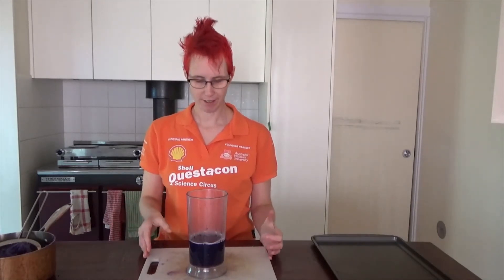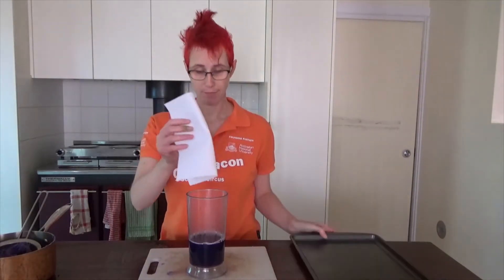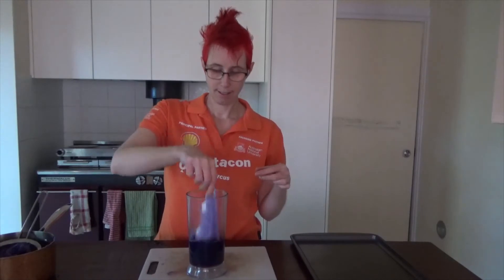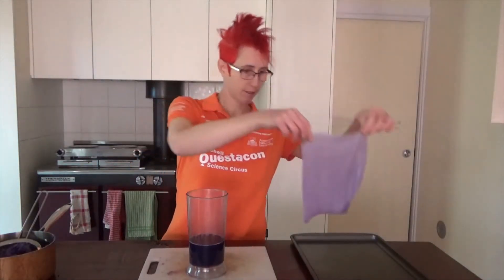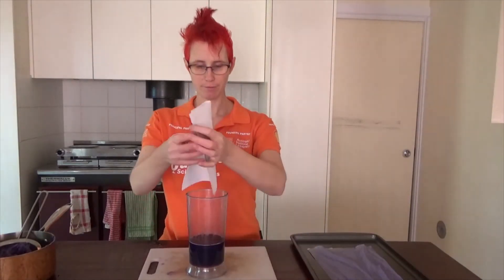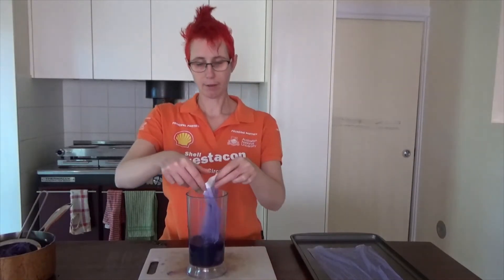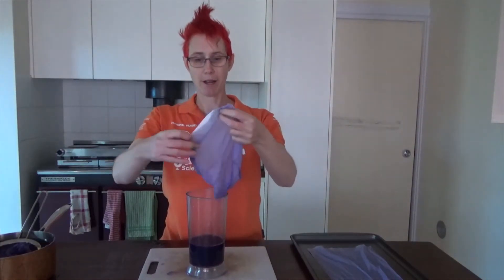Look at that purple color — isn't that great! The reason I have the board is to stop any spills, because we are trying to get the anthocyanin out of the cabbage and use it to stain the paper, and that means the anthocyanin will also stain other things. So we've got our paper — I'm just using some paper towel — and a tray to dry in because we don't want to just leave it on the bench. If you don't want your fingers stained, dip the paper into the cabbage juice but leave some dry so that you don't get it on your fingers. Once it's nicely dyed, lay it out on your tray. Once we've got our paper ready it will take about overnight to dry, and then tomorrow we'll be ready to test with our brand new pH indicators.